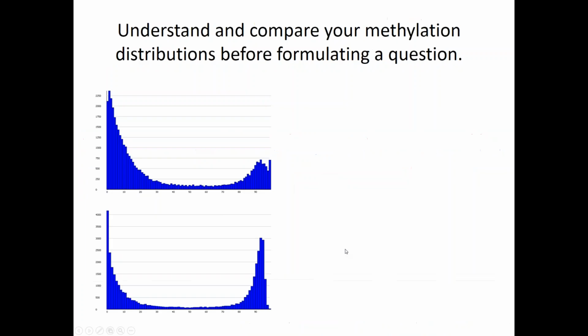We can also start summarizing the methylation. One thing that's always very interesting to look at is the distribution of methylation levels across your genome. People often cite values for the average methylation level for a genome, saying what the mean methylation was for the genome as a whole. But those sorts of values are actually not a great summarization of methylation. If you look at the distribution of methylation levels in a genomic sample, you find that it's not a single distribution around a mean.